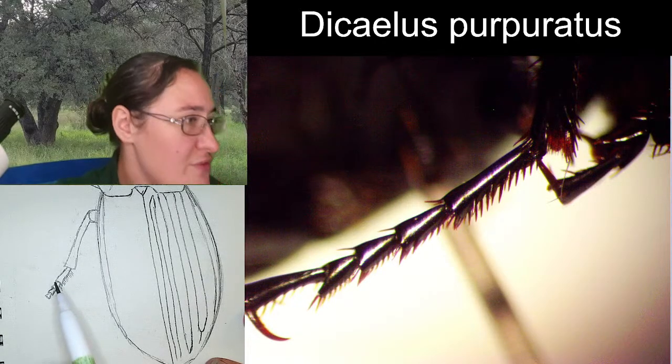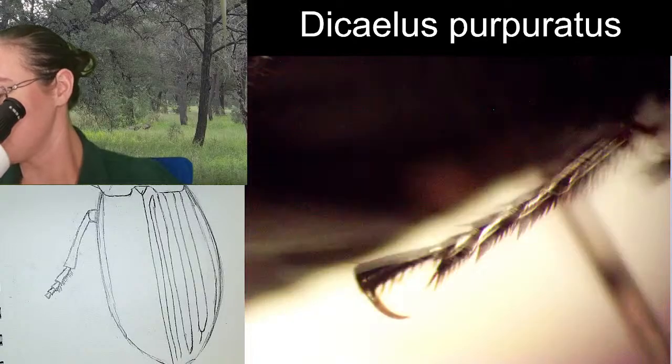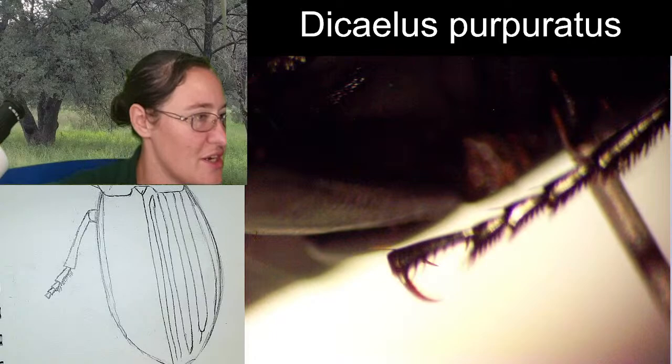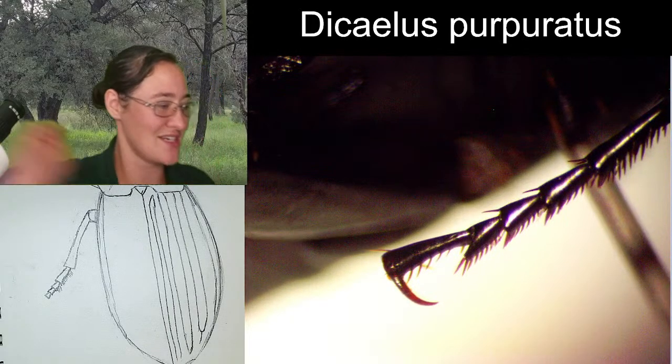One, two, three, four. And then that final tarsal segment right here. Look how big those tarsal claws are. It's definitely holding on nice and strong.